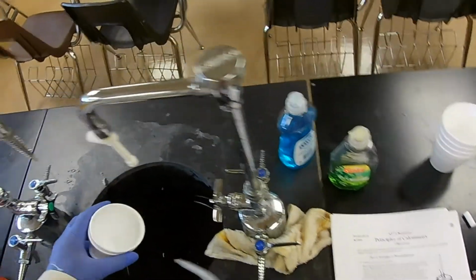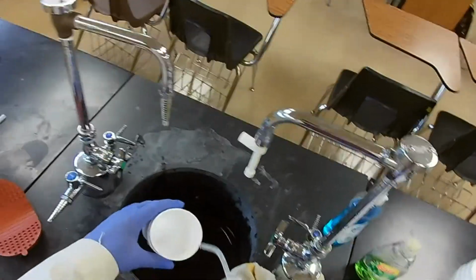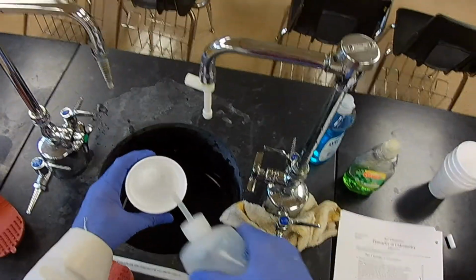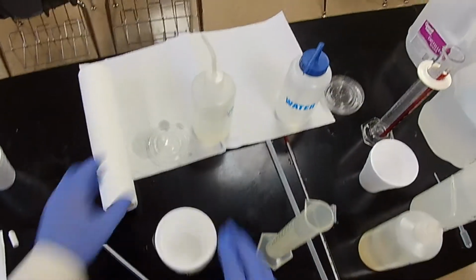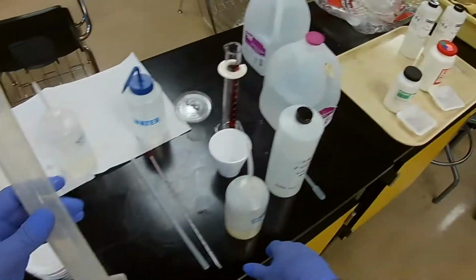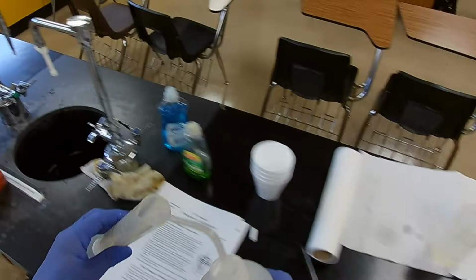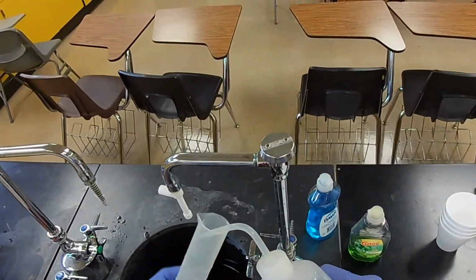And okay. Now temporarily we'll just set that there. And let's see, did we rinse this out? I think we better rinse it again just to be safe.